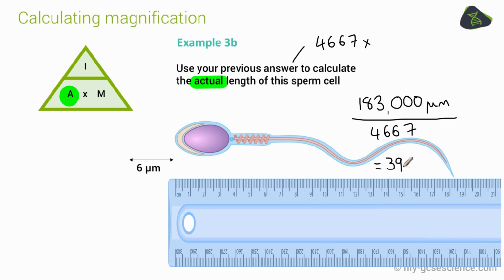It's actually 39.2, but we'll just round it down to 39 micrometers.